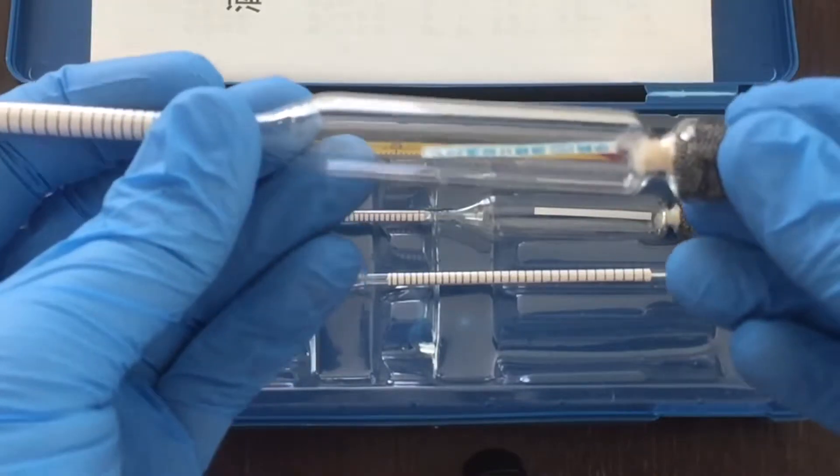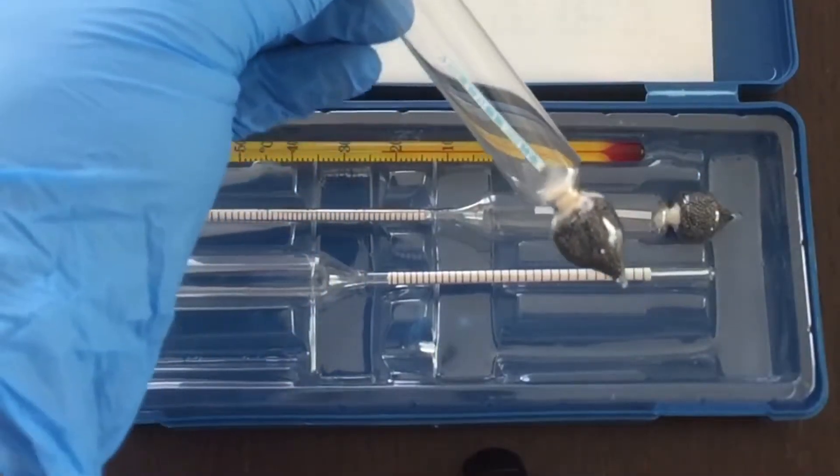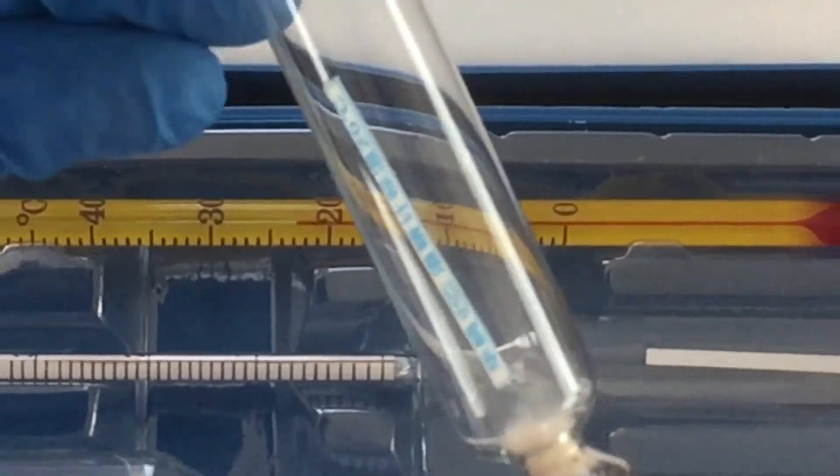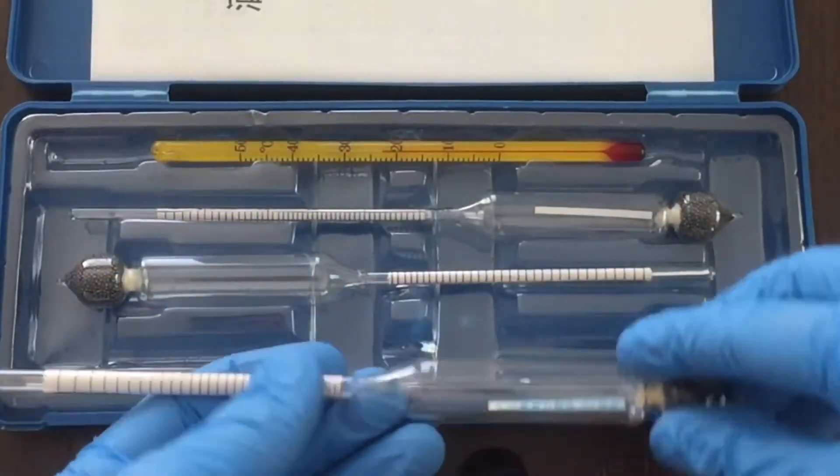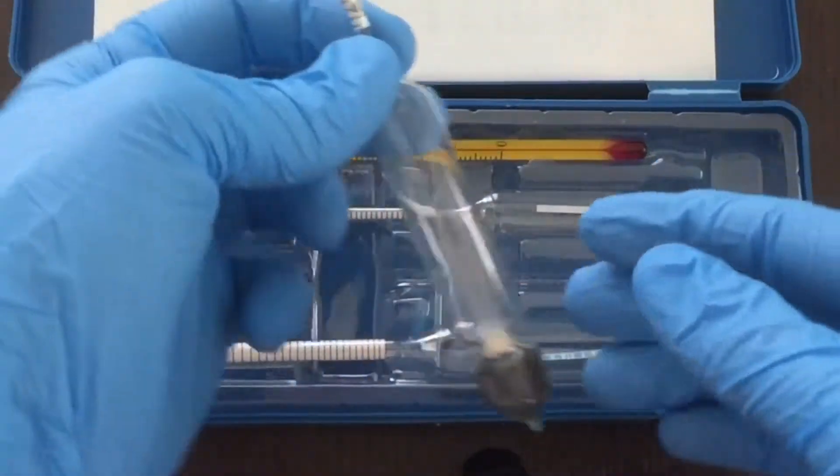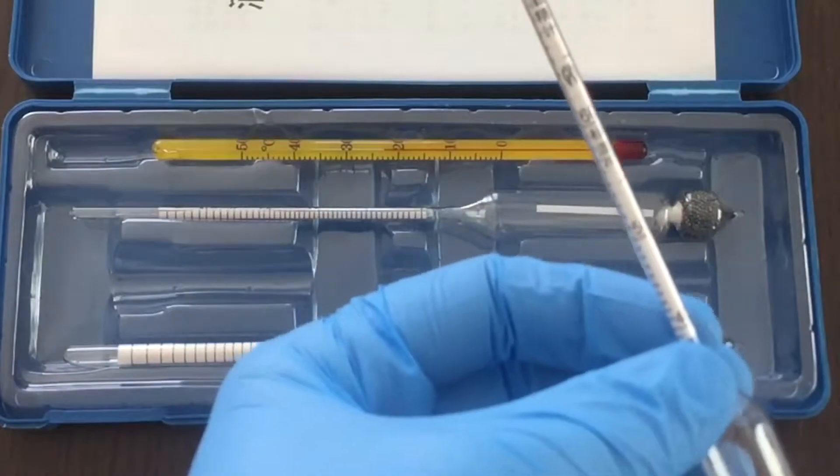So I bought this kit on eBay from a seller named KE661, although I'm sure there's probably many other sellers out there that are selling the exact same thing. That seems to be the way eBay goes. I bought it for $5.99, so pretty cheap.